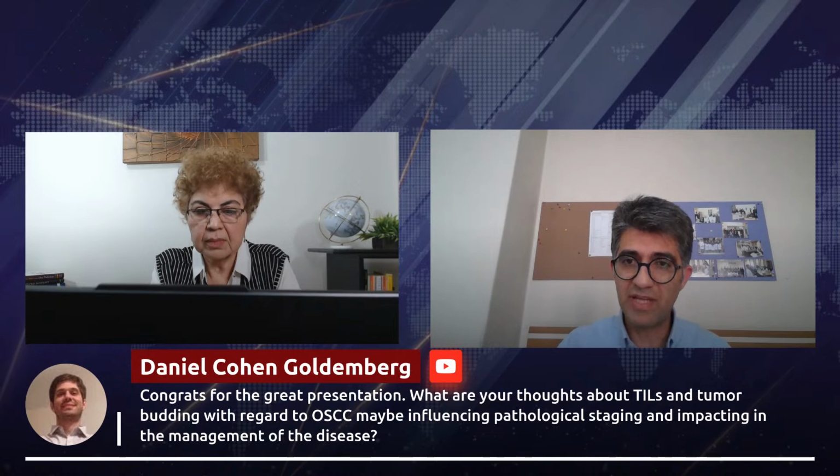Conclusively, I think that the invasive front of oral squamous cell carcinoma is very important in the prognosis of the tumor, and it will be included in the report and in the CAP template very soon, because of the great impact of the tumor at the invasive front on the prognosis of the patient.